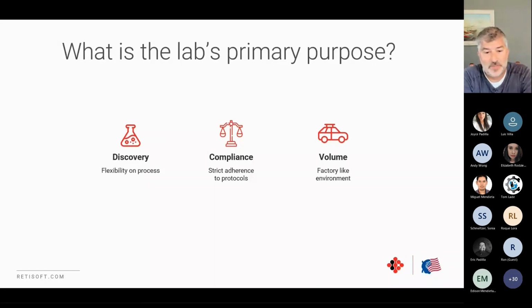Keep in mind, some combinations of these options work. Some are more trouble than they are worth. Maybe you need multiple labs and systems for a better return on investment instead of trying to fill all the needs with one solution. And you may also be doing it just for fun. Maybe you just want to play with automation or try a new system just for fun. That's also an option. But many of these things still apply just to actually keep it functional instead of just being a nuisance.